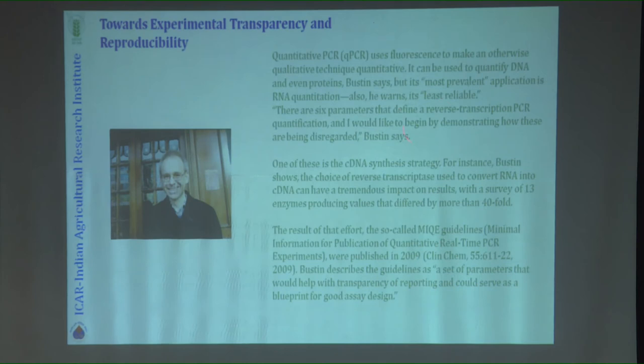minimum. I will just read out from the next slide. Oh, right, here. Minimal Information for Publication of Quantitative Real-Time PCR Experiments. This is the MIQE guidelines, which is published in Clinical Chemistry, which is an important paper. Although you can use it for DNA, if you are using it for RNA, then one has to be really careful about the issues related to reverse transcription PCR quantification.